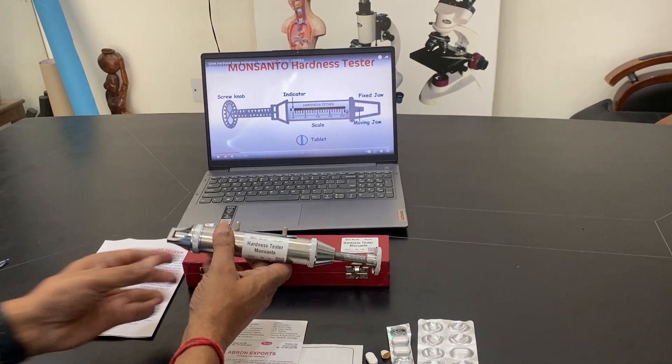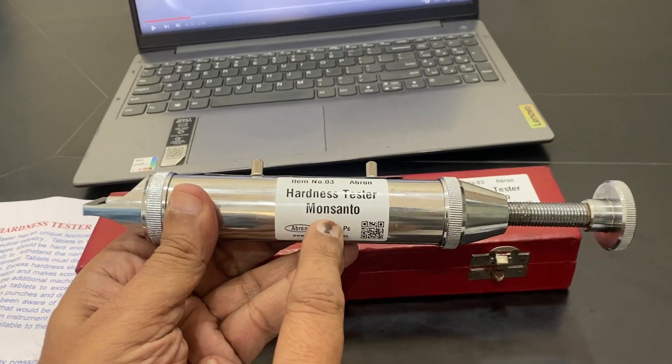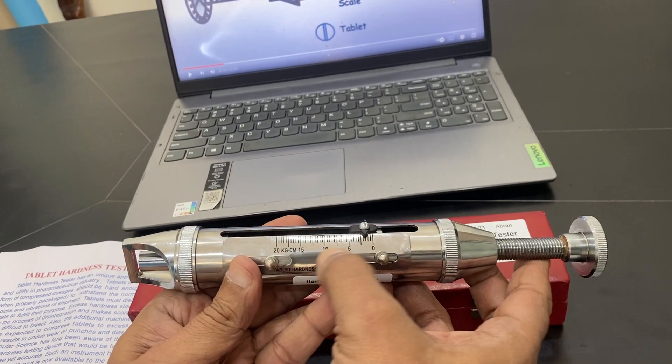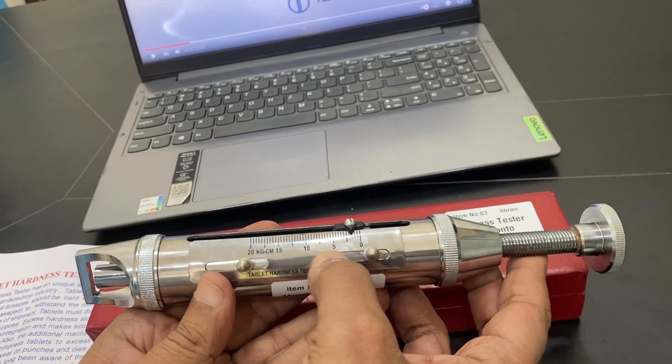Welcome to a video by Abron Exports. This is a Hardness Tester, Monsanto type. It has a manual knob and the scale is there — 0 to 20 kg per centimeter.